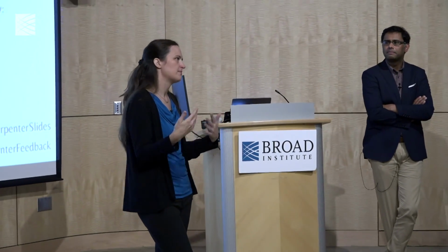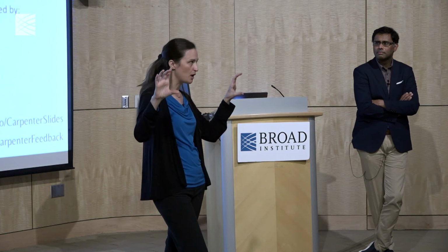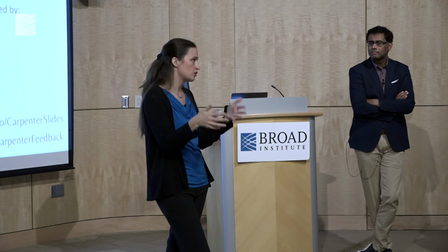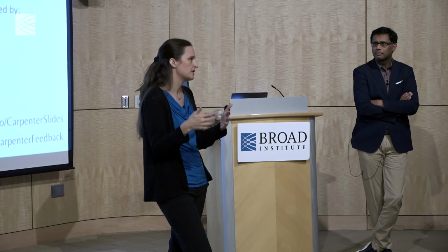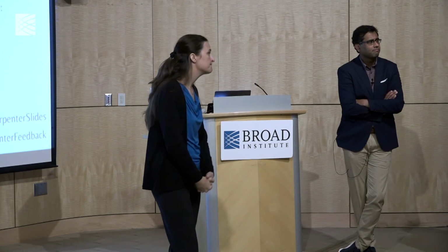And that's why I would never recommend doing an experiment in U2OS cells and then taking it right to clinical trials. In reality, you still want to go through the same sensible steps for each disorder, but at least this is a really wide, broad, systematic approach to get you to, okay, out of the 4,000 rare diseases, here's 200 of them that are tractable in this way. Now we can focus our energy on those 200 and then take them to more translatable, more physiologically relevant model systems.